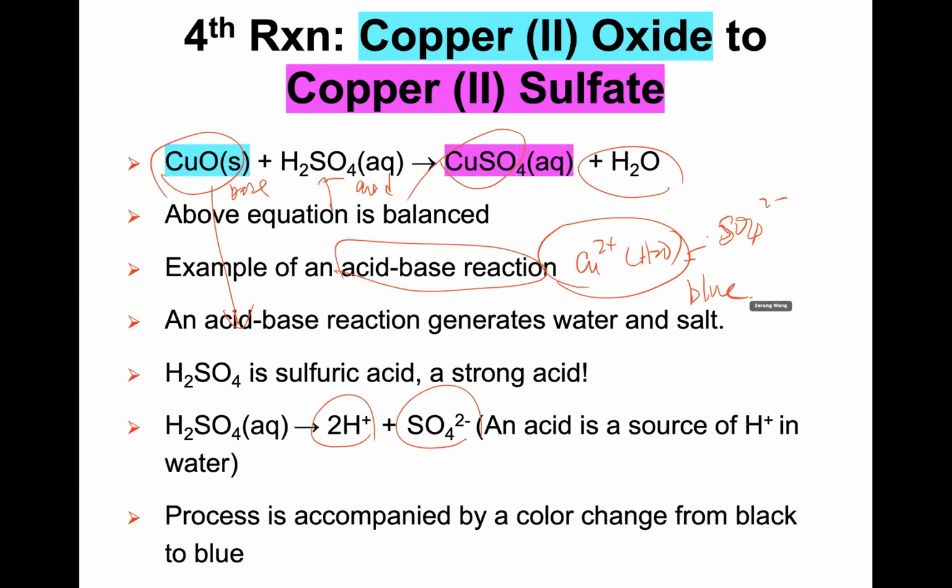Just like you saw the color earlier. Now remember, the color is almost the same as this one, with the associated water.